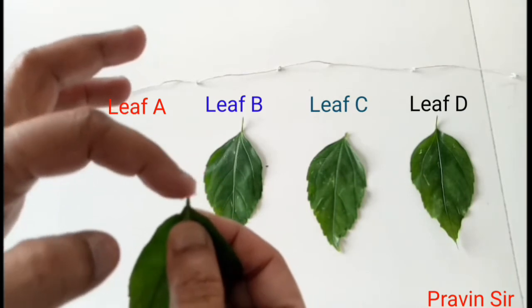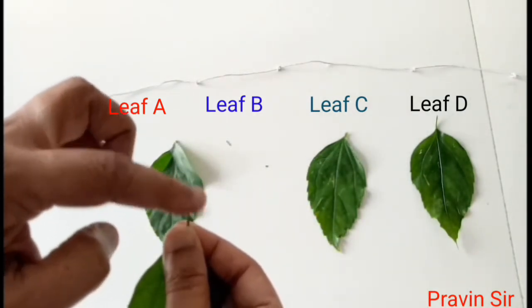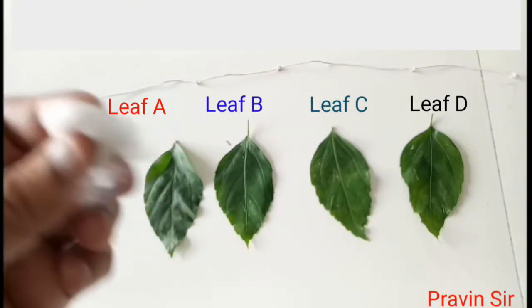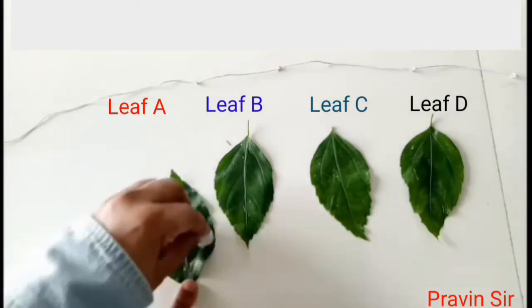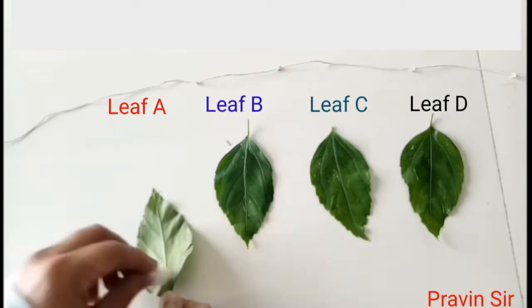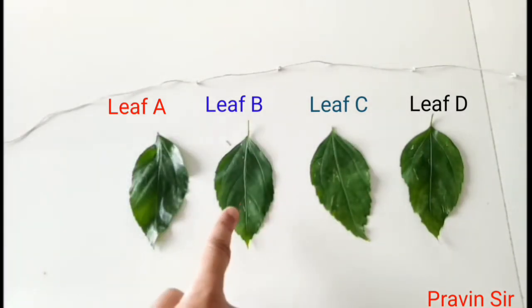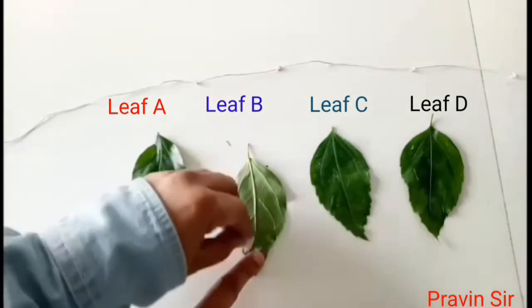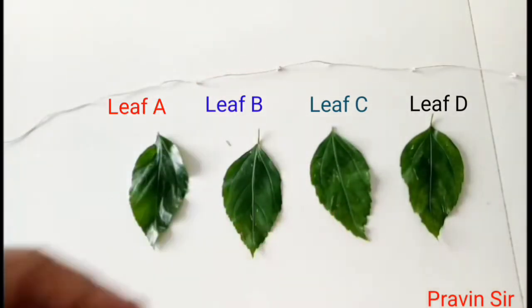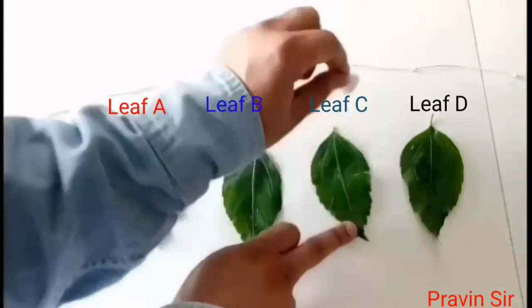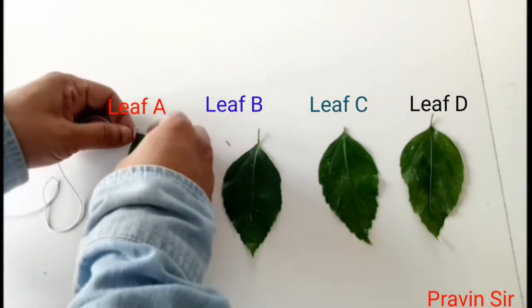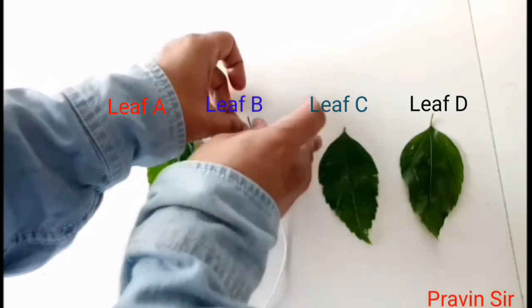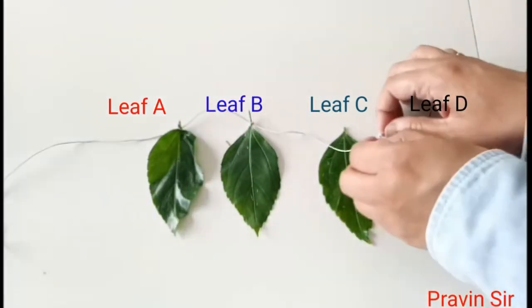Apply vaseline on the plucked end of the petiole in all four leaves. Now, with the help of cotton, apply vaseline on leaf A on the upper surface as well as the lower surface. On leaf B, apply vaseline on the lower surface. On leaf C, apply vaseline on the upper surface. On leaf D, no vaseline is to be applied. Tie the different leaves with string so that they are equidistant and the surfaces are properly exposed to sunlight.